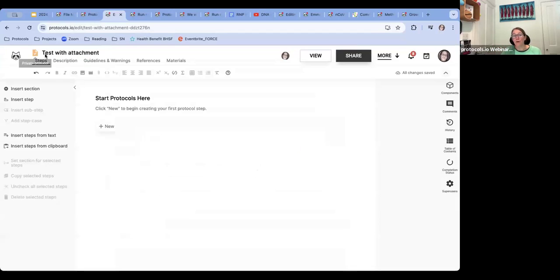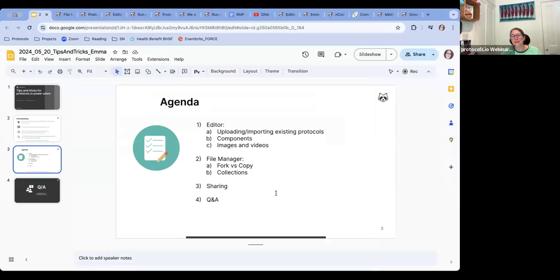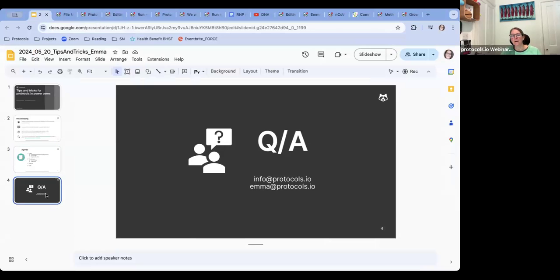I think that was a lot, but that was all the parts I was going to go through today. We've probably got time for a few Q&A if anyone has any questions. Hopefully that's been helpful information. I will stop the share, but I can bring it back up if anyone has a question.